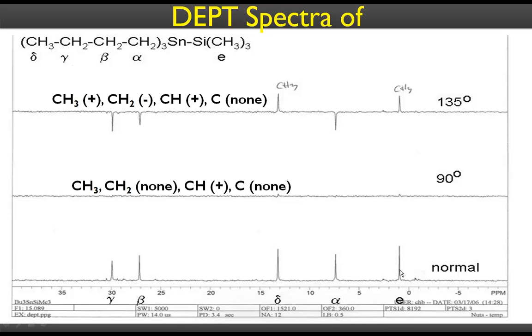Okay, so this is the normal CH3. That's pretty positive, so it must be attached to silicon, right? It's quite near to 0, right? Shielded. And this is alpha, which is close to the metal, that is beta, and that's gamma, and that is delta.